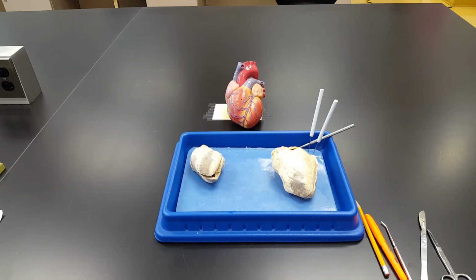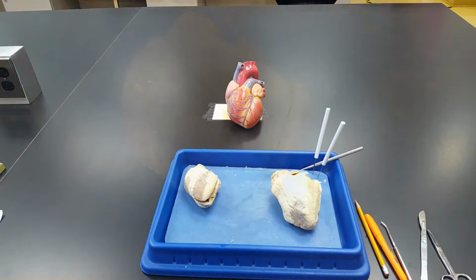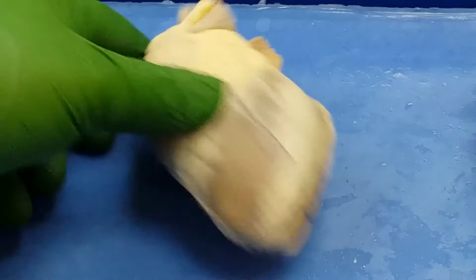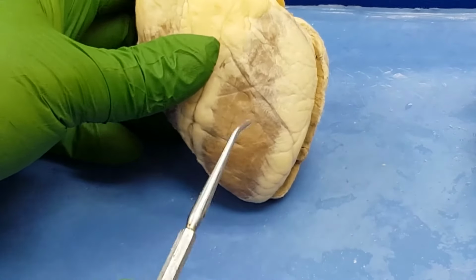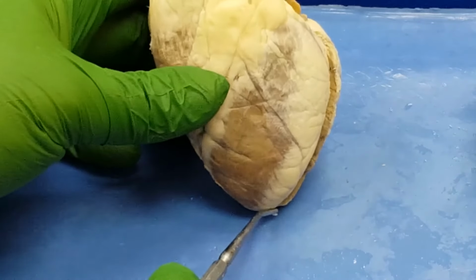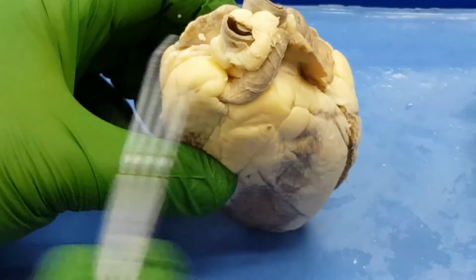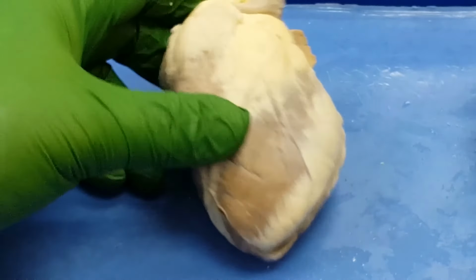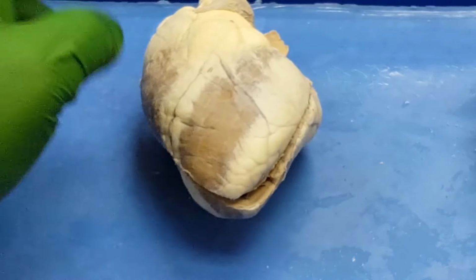So I'll do a little camera work, a little zooming here to try to show you some of these structures. So let's look first at this slightly smaller heart that you see. Maybe you can notice that this is the apex, not that it's on the list for the sheep heart, but here's the apex. I can see great vessels up here. They're always cut fairly short in these prepared sheep hearts. There are many ways that you might see people dissect a sheep heart, but this is my way.